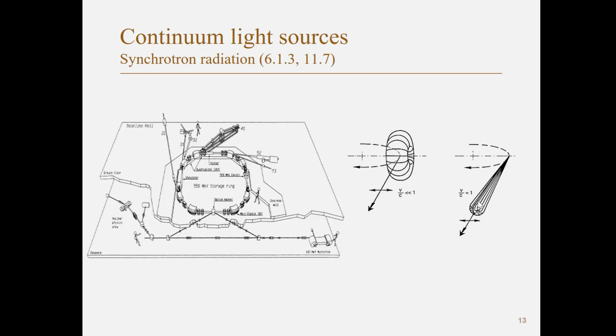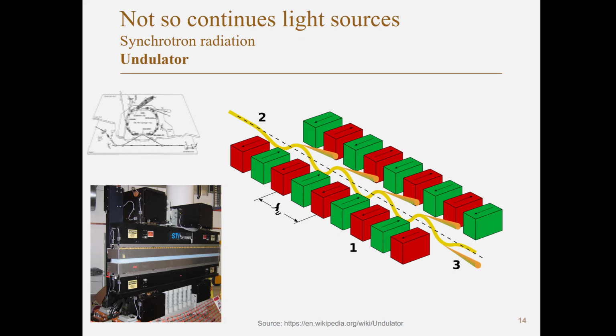And this beam is very, very broad in frequencies. And I say that this is how it used to be for the first synchrotrons, this is how the radiation was generated. But nowadays it's actually the straight part of a synchrotron which is used to generate the light, or the electromagnetic radiation. So what you have here is something called an undulator. And this is an undulator here. So what this is, the beam comes going through in between these two massive things here.